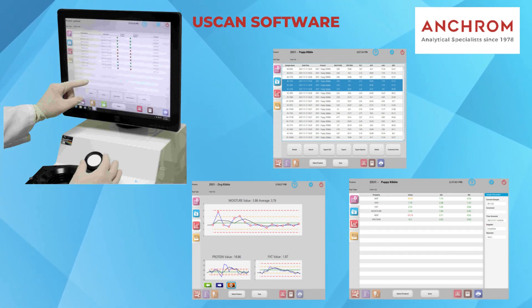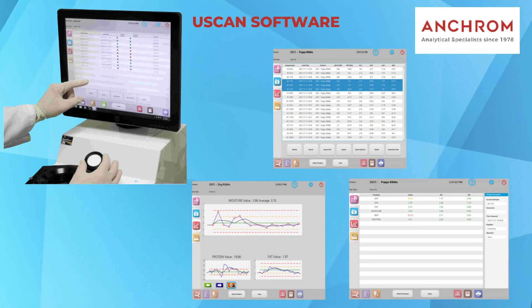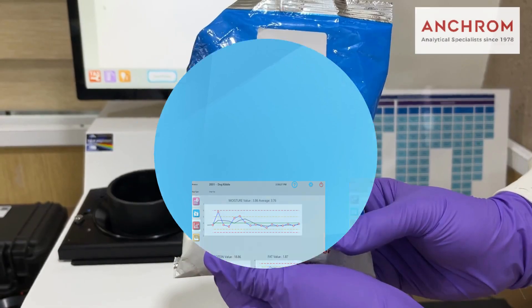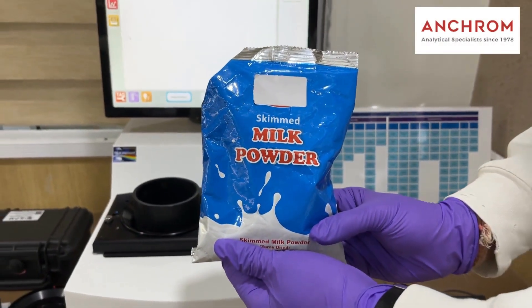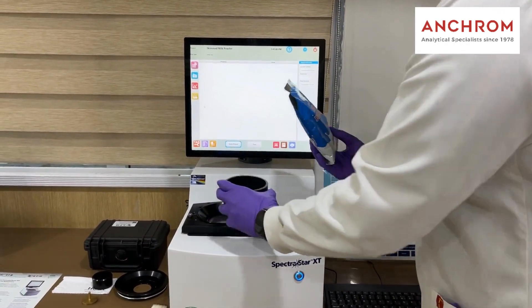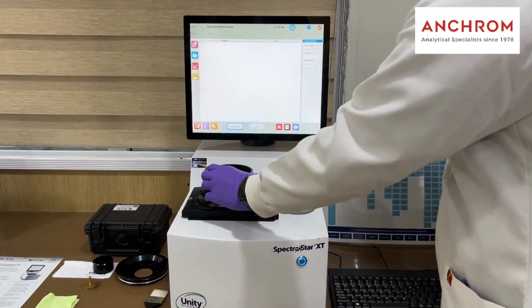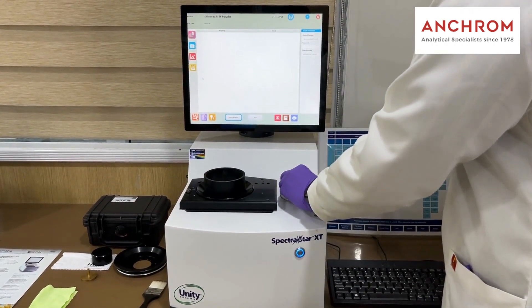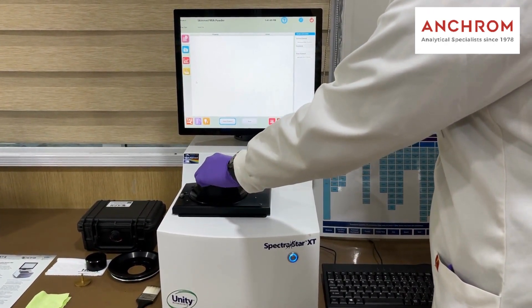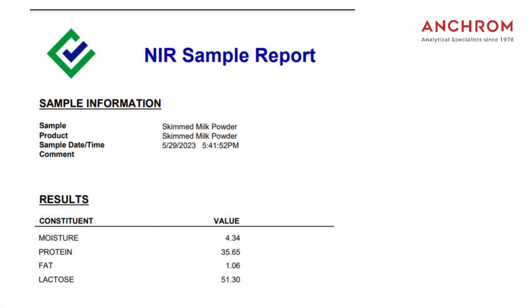For user-friendly operation, we have the uScan operation software, designed for touch screen functionality. It requires minimal training for routine operations, making it convenient for users. Now let's see an example using skimmed milk powder. Start by taking a sample and thoroughly mixing it. Then simply place the sample into the cup, insert the plunger, and press the scan button. Within a few seconds you'll have your results. Since there are no chemical reactions involved, you can further test the sample if needed.